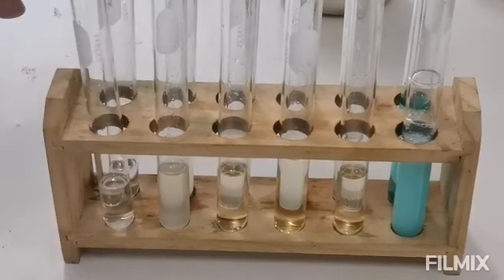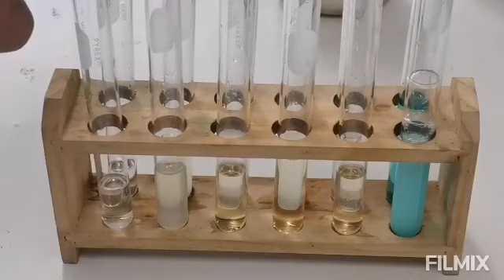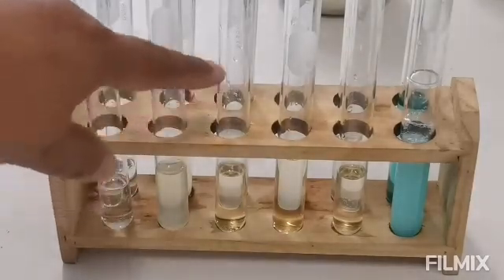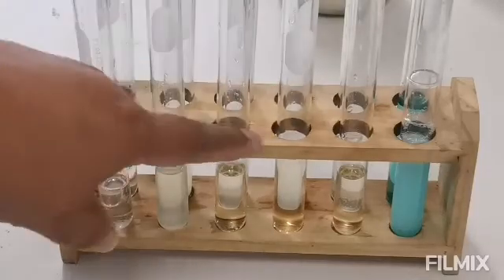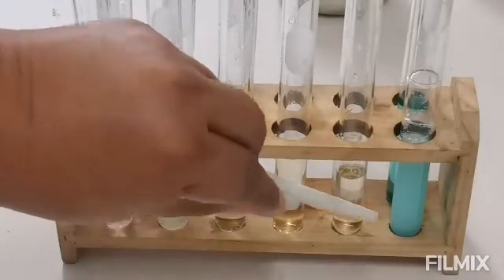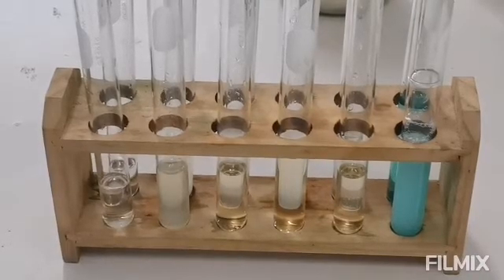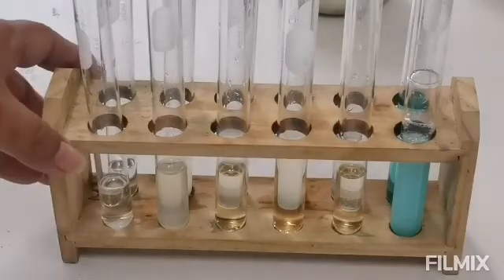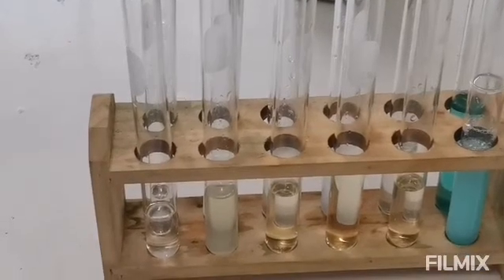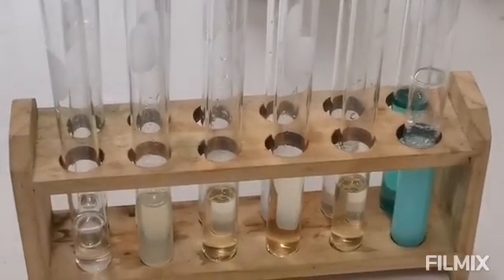And then at the other side, this is your meat extract added with sodium hydroxide and copper sulfate. This is your sodium chloride, sodium carbonate, citric acid, ethyl alcohol, and silver nitrate. Please take note of some changes that you think had happened within just a few minutes after adding the different test solutions.